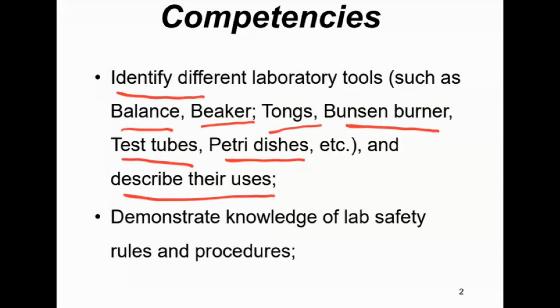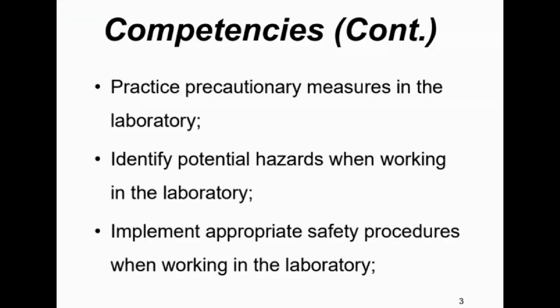And I will also explain the lab safety rules and procedures. I will explain how to practice precautionary measures in the laboratory. We will also identify potential hazards when working in the laboratory.